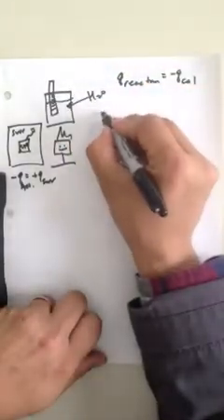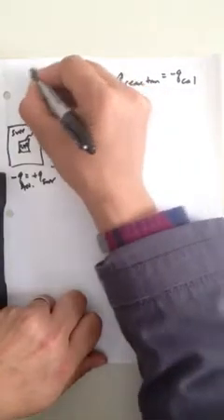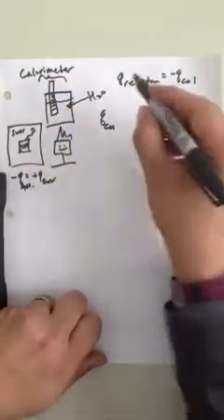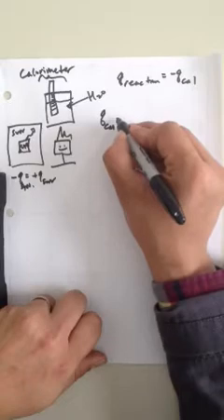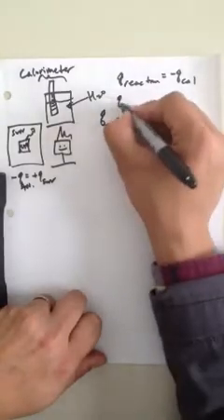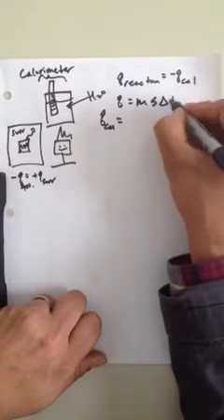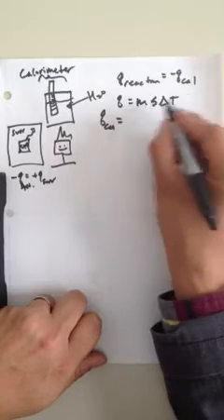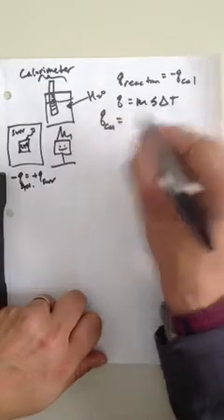The equation for the heat of our calorimeter, that's what this guy is called, right? Because it measures heat in the form of calories, although we're using joules because we're awesome. The equation for all heat flow is going to be Q equals m s delta T. And in this case, remember, m is the mass of the substance, s is the specific heat of the substance, and delta T is the change in temperature.